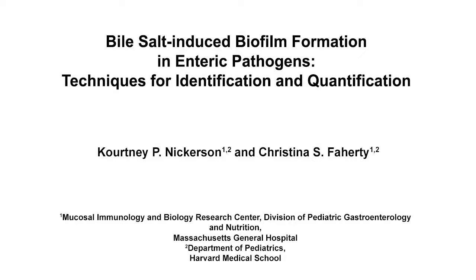The overall goal of this biofilm formation and assessment protocol is to determine the ability of enteric bacterial pathogens to form a biofilm, especially in conditions that mimic gastrointestinal transit and exposure to bile salts. The methods can help answer key questions in the bacterial pathogenesis field, such as the ability of enteric pathogens to survive the harsh bile salt conditions of the gastrointestinal tract.